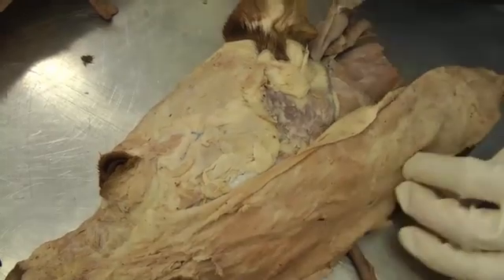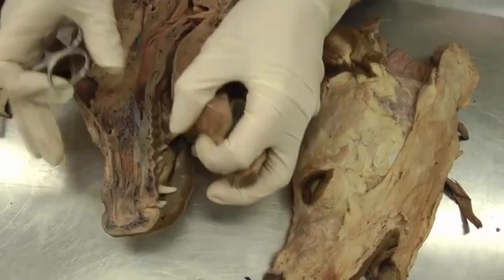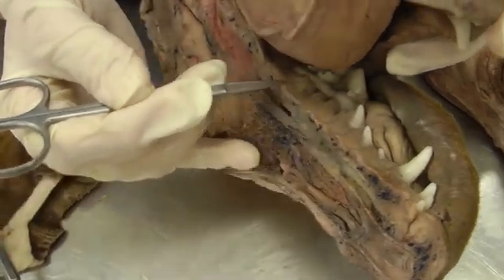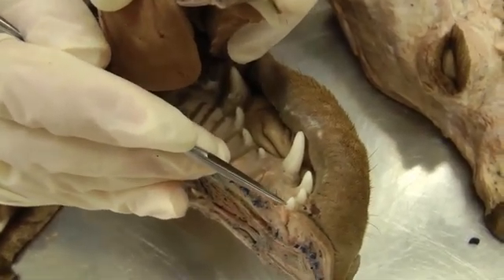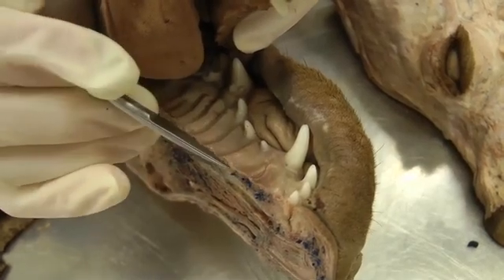Moving to the palate — back to the right side, where most of the incisive papilla is. Here's the hard palate and the soft palate back here. The incisive papilla is just this little nodule right behind the incisor teeth — incisive papilla, right there.